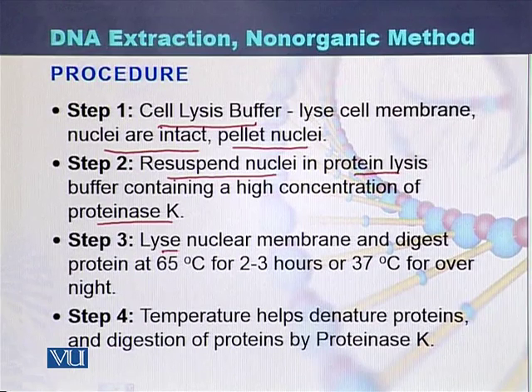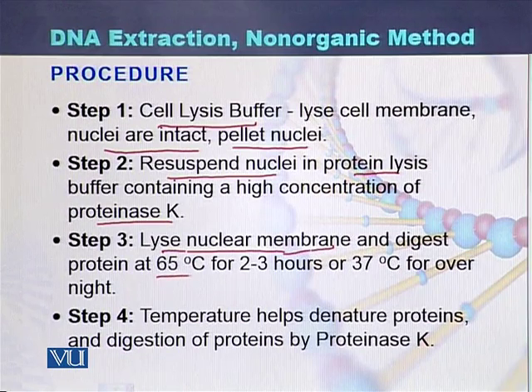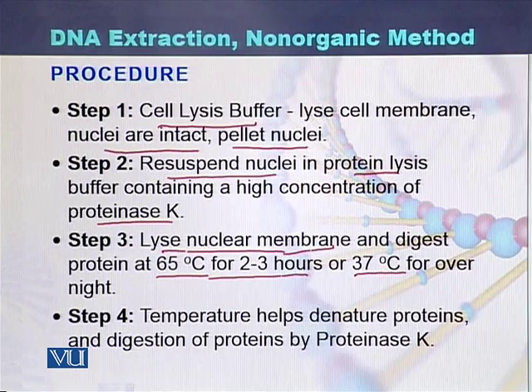During step 3, the addition of the proteinase K, SDS and protein lysis buffer lyse the nuclear membrane. Once the nuclear membrane is broken, this process is completed at a temperature of 65 degrees centigrade. If the temperature is 65 degrees centigrade, it is recommended for 2 to 3 hours. But if a person wants to keep the sample at 37 degrees centigrade, then it is recommended overnight. So this process either can be completed within 2 to 3 hours or it can be kept overnight.